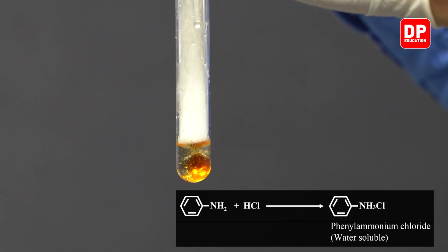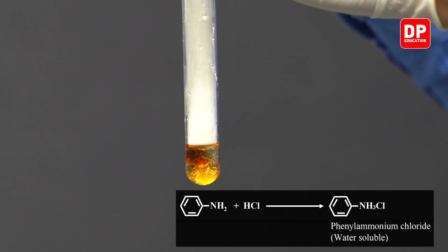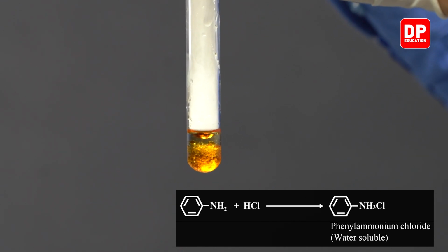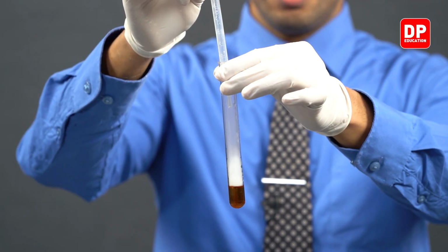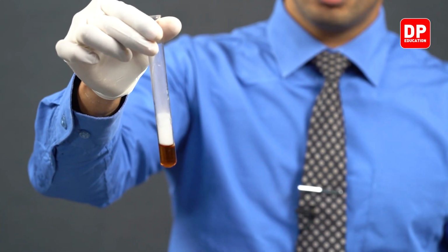The acid, which is HCl, reacts with the base aniline and forms a salt. The salt that is formed is referred to as anilinium chloride. And as you can see, it dissolves well in concentrated HCl and forms a solution.